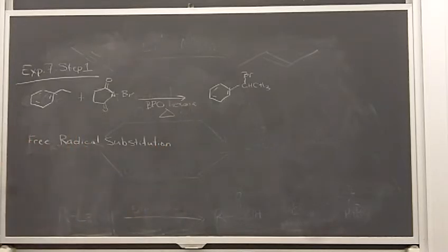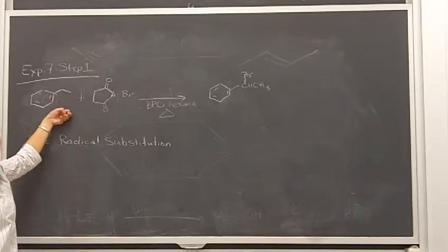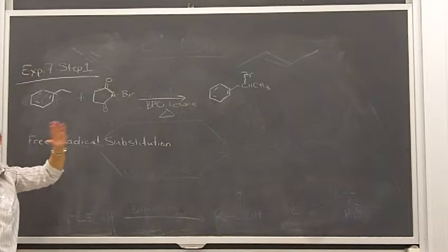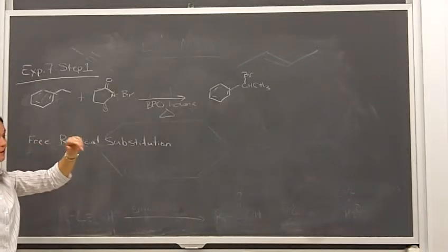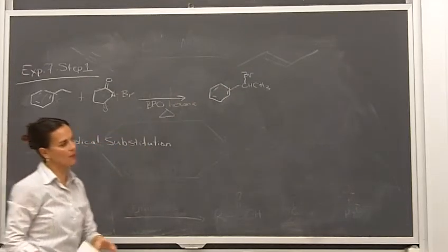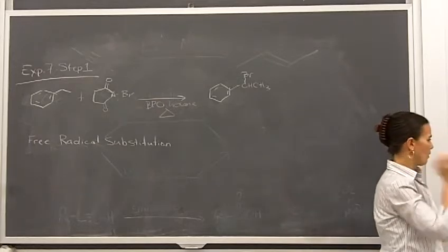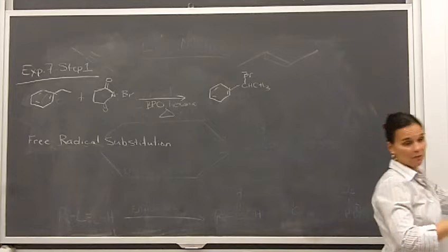A couple things to be careful of when we start heating this reaction at reflux. It may start doing a nice calm reflux, but you've got to keep an eye on it, and you may potentially be turning the heat down, because as soon as that benzoyl peroxide starts reacting, as soon as we give it some heat, we've got some radicals in there, and that's going to jumpstart everything.